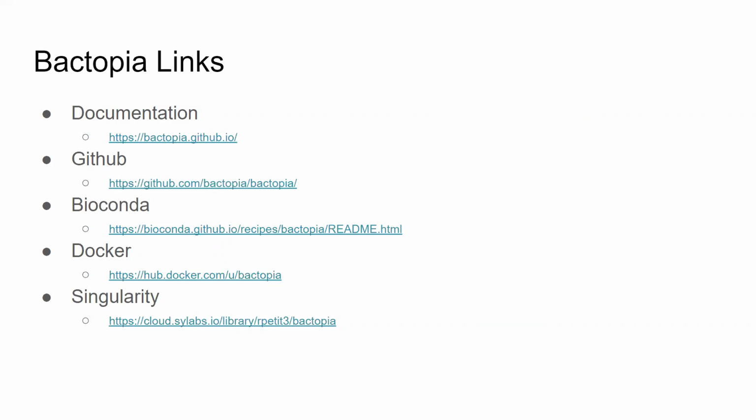I think the public health use cases are pretty apparent straight on. I had a question about one thing that we're considering here at the Virginia Public Health Lab, especially instances where there are interstate outbreaks. Right now, we rely on the nationally curated database for the enteric pathogens, things like the BioNumerics side of things. For other things, we also have NCBI's Pathogen Detection, where they automate the cluster detection.